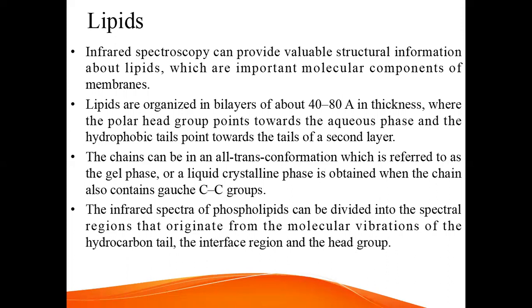The infrared spectra of phospholipids can be divided into spectral regions that originate from the molecular vibrations of the hydrocarbon tail, the interface region, and the head group.